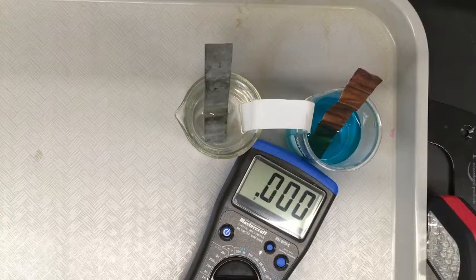So now we're going to do part 2 of the investigation. We're going to find out what happens when you combine different half cells and how that'll affect the voltage produced by the voltaic cell. So we'll make a few other half cells. We'll keep copper the same, so we'll use it as our positive electrode. And then we'll substitute in different electrodes.